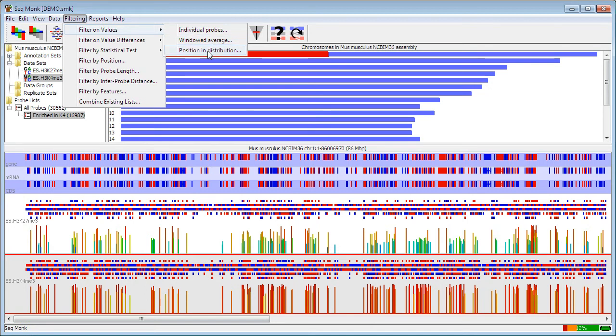Finally, you can filter on the position in the distribution, so in this case, instead of specifying an actual numerical cutoff, you specify a percentage through the distribution, so you can remove the top 1% of probes, or something similar to that.